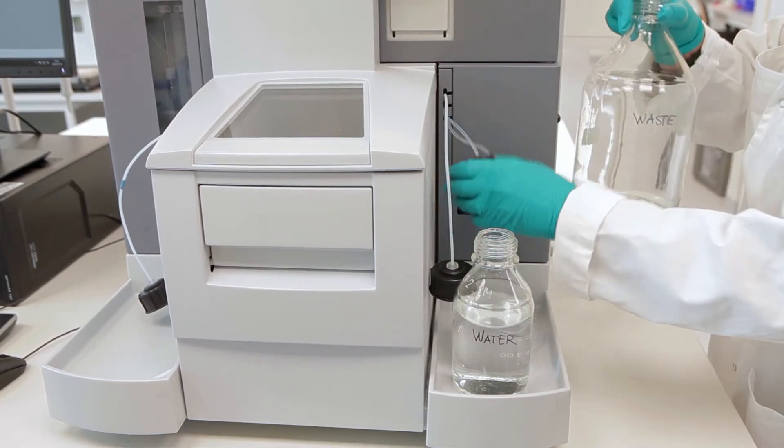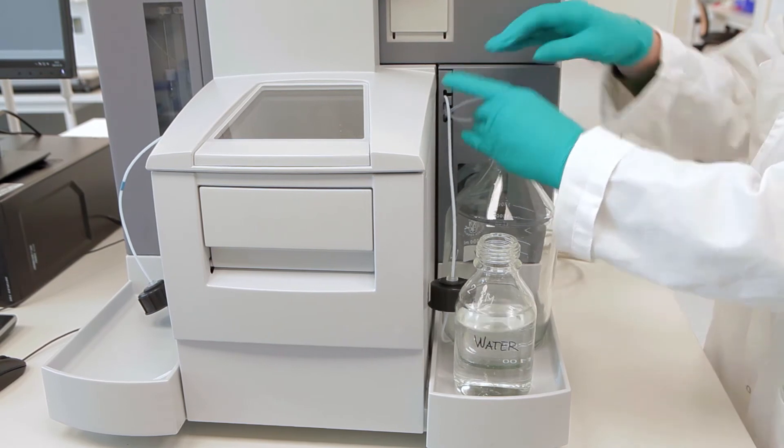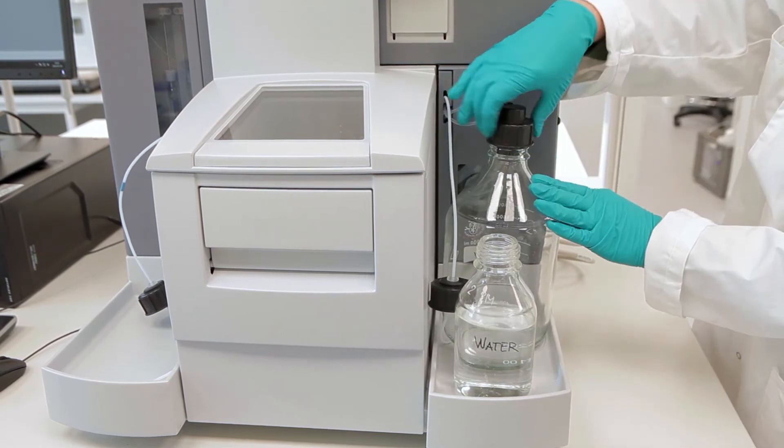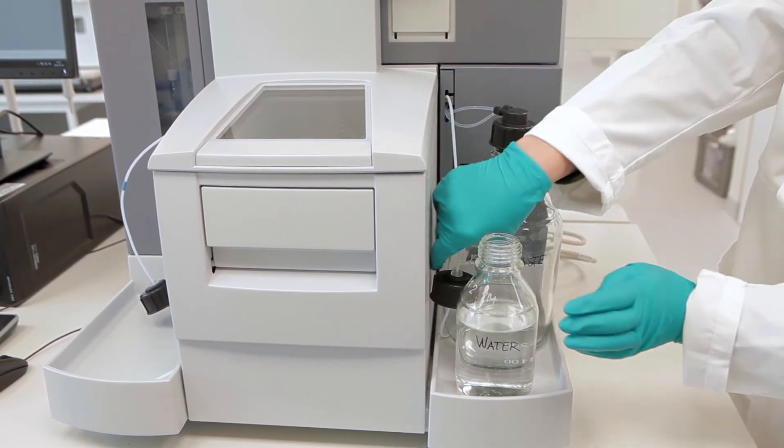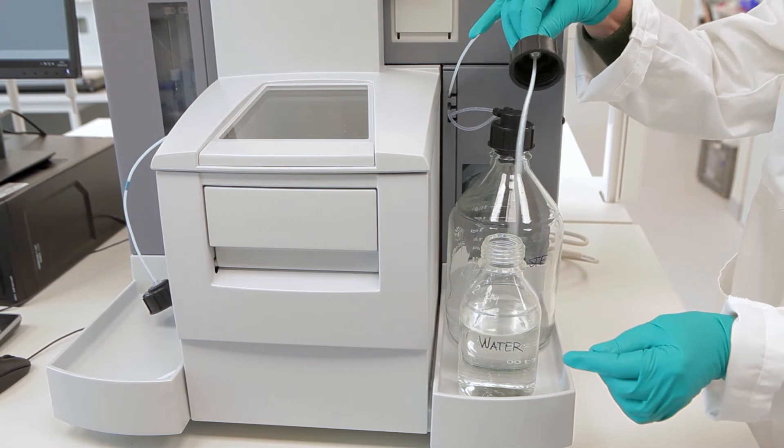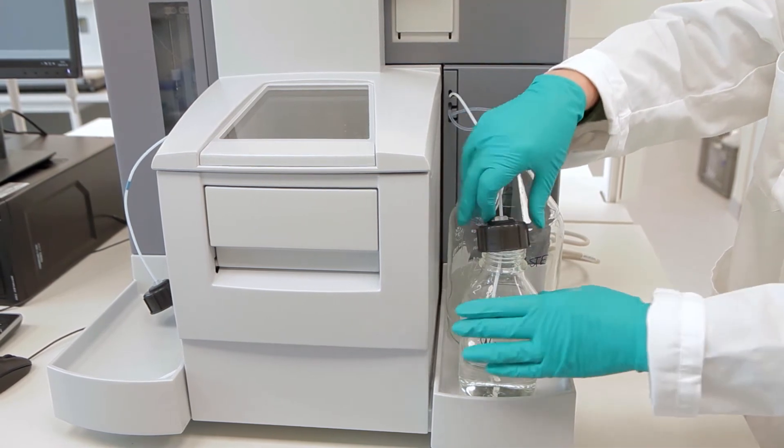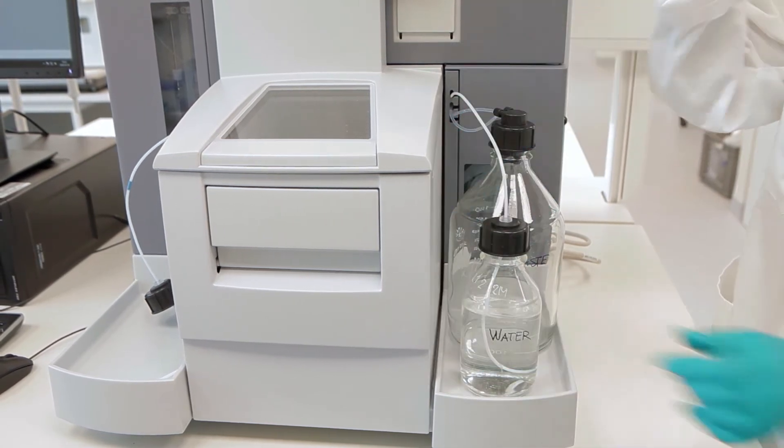On the right hand side tray, place a 2 liter bottle for waste and insert the waste tube, and a smaller bottle of distilled water and insert the water tube.